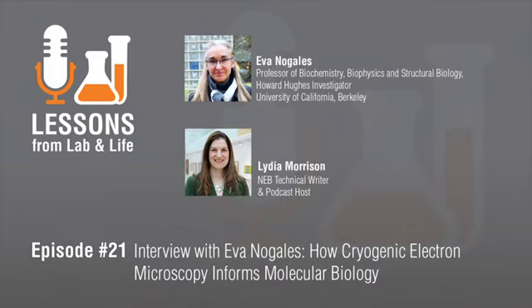And it just so happened that the systems that I was interested in characterizing are of that type. One has to do with microtubules. They are a polymer that by definition is uncrystallizable, and the other are very large protein complexes involved in gene expression regulation that due to their size and due to their flexibility have resisted crystallization for many years. So what attracted me to this technique was the fact that I could use it to visualize whatever it was that I was interested in.